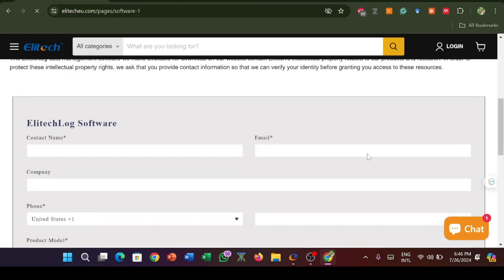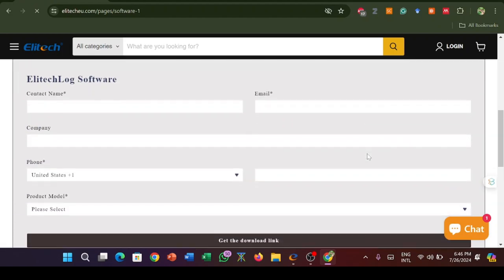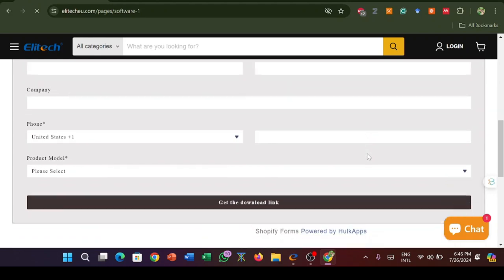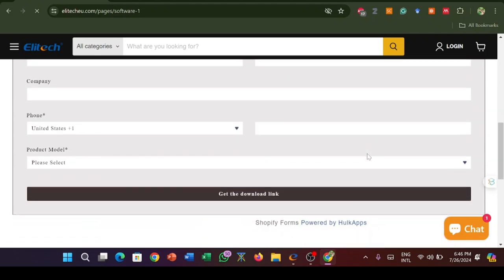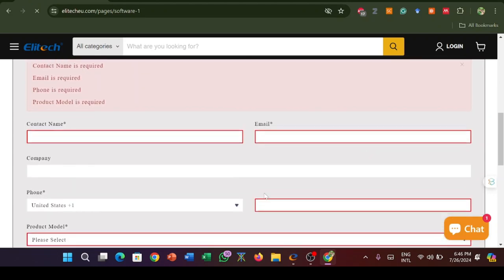To access the download link, fill in the required details and proceed to download.